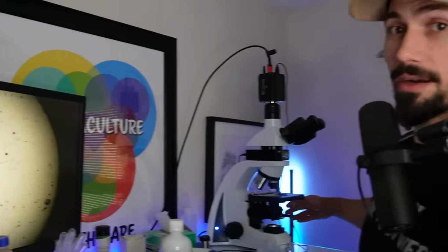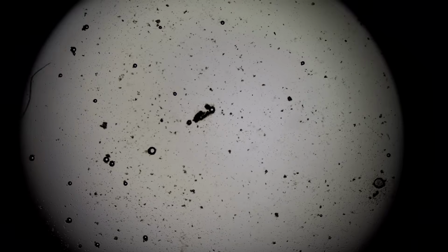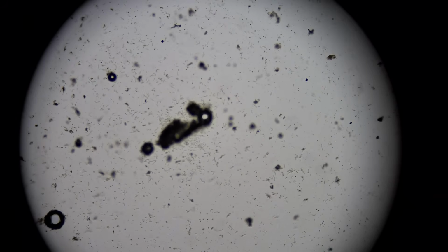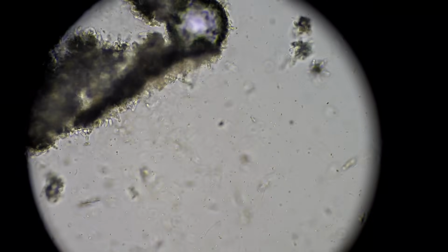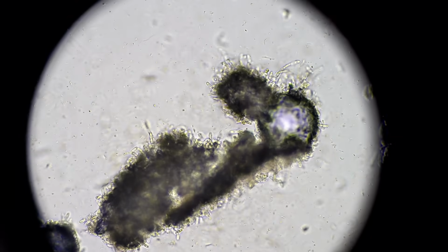We're gonna just hop in here. You can see here I'm on a screen right there. I'm gonna jump in. We're zooming in further. It's just the next objective up, sharpening the image for you. See this flake right here? You guys see this? This flake right here? This is yeast. And we'll see as we get closer. We're now at 400 times magnification, and we can just see, holy cow, look at that.